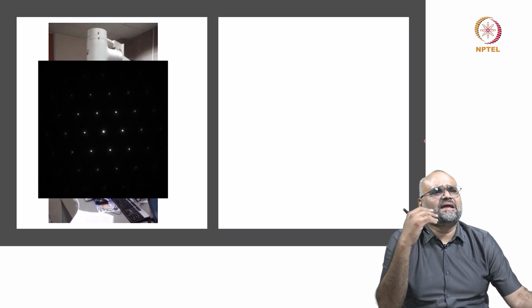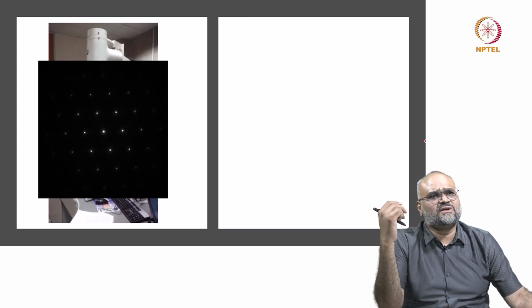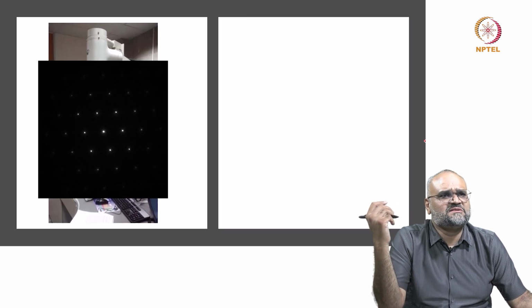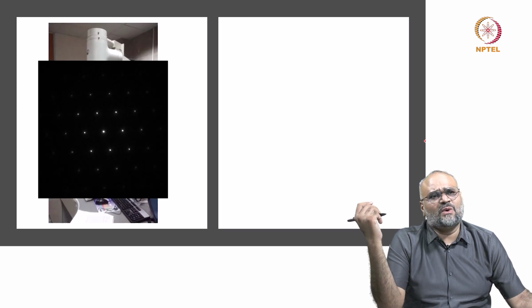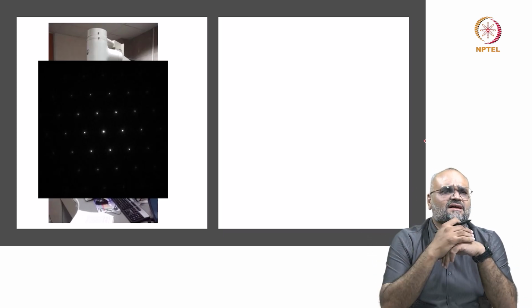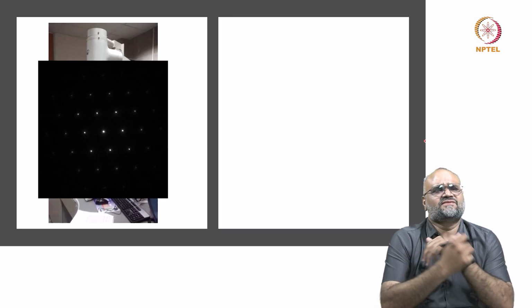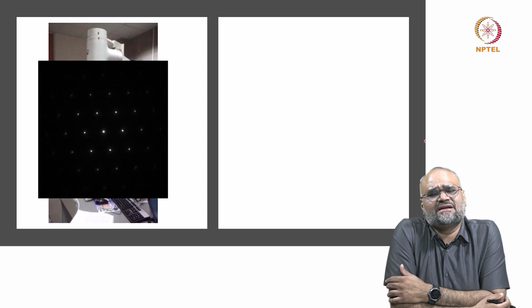So, when you align the crystal into the zone axis and you look at the spot diffraction pattern, it would appear somewhat symmetric like this. And once you do this, on the grain on which you've aligned, you have to actually go to an amorphous area and you have to start doing a few corrections.